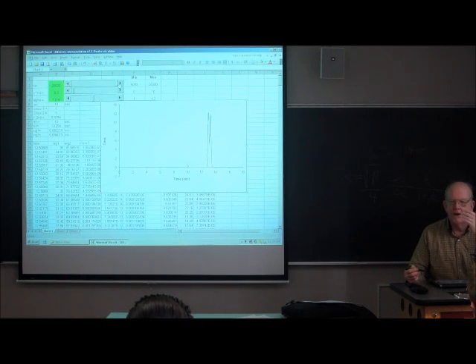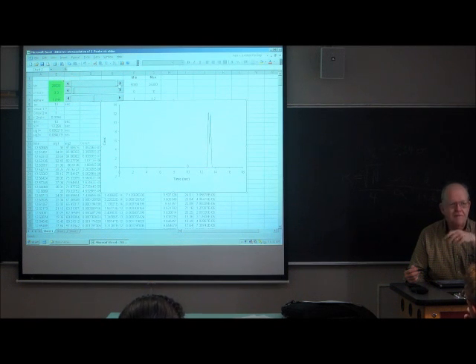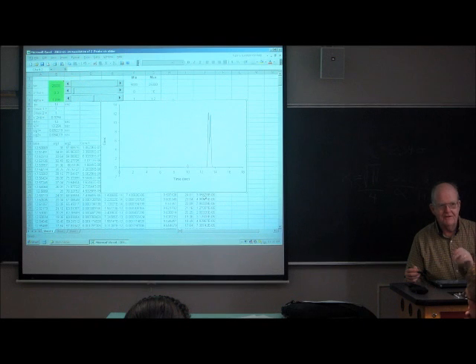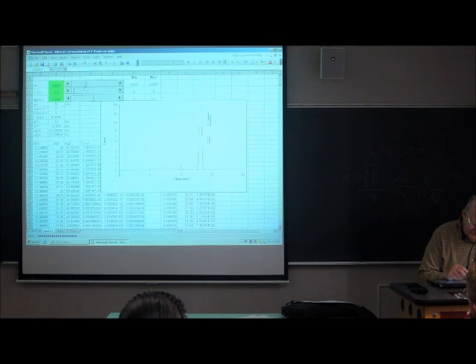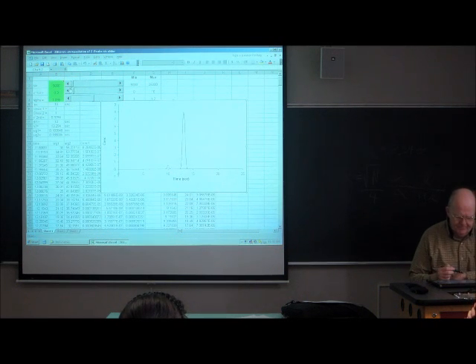Now there's no way I can tell you how to increase the plate count by a factor of 5 without some major changes, like making the column 5 times longer. If you made the column 5 times longer, it would take 5 times longer for the stuff to come out of the column, and I didn't change the time scale, so there was some serious magic there. But let's run this back down to its initial value. Okay?